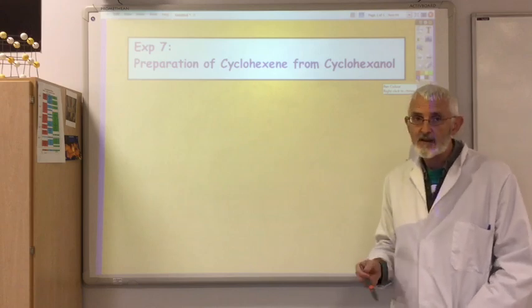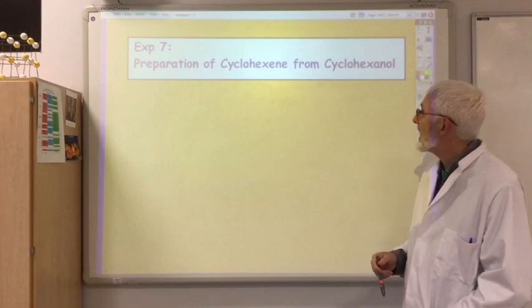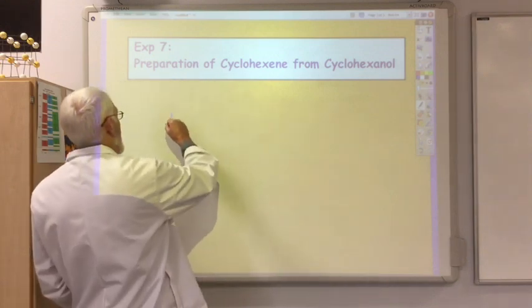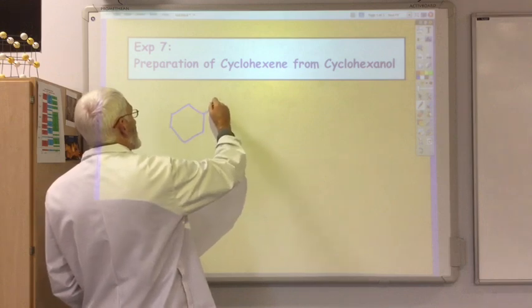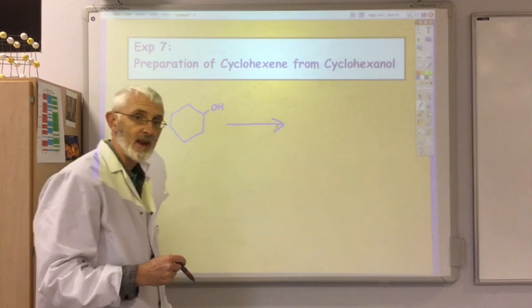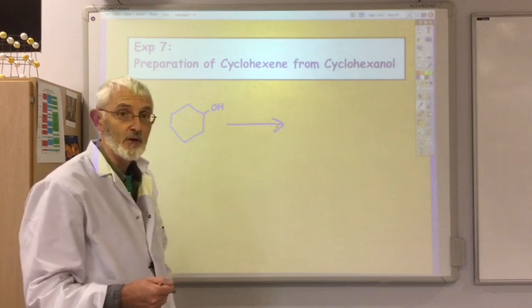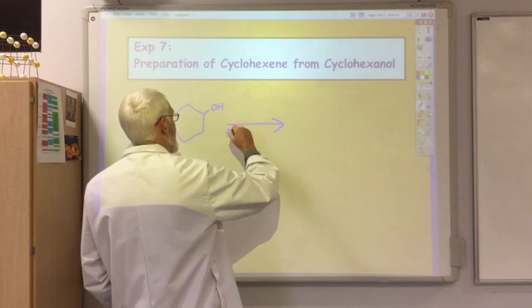In this experiment, the first one in the organic synthesis section, we carry out a fairly simple preparation producing cyclohexene from cyclohexanol. This is quite a straightforward reaction. You start off with your cyclohexanol, and there are two ways in which we can dehydrate cyclohexanol to cyclohexene: either using concentrated sulfuric acid or phosphoric acid. In this experiment we are going to use phosphoric acid as our catalyst.